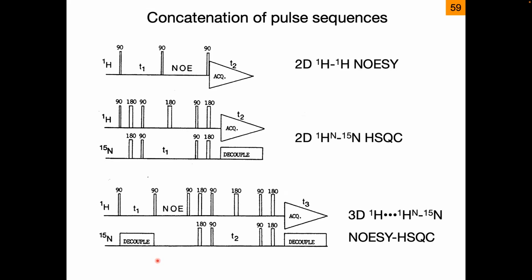You go to minus Z, and then this proton will see the rest of the protein and tries to come back. How does it come back? By fluctuations of the magnetic field that are induced by the rotation, and these fluctuations come from dipolar couplings. And so this is a relaxation effect in the end.